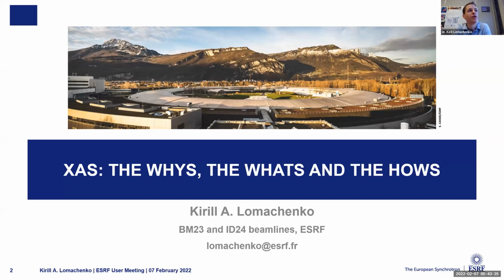What's lithium? Let me see. Yeah, it's like 30 electron volts or something like this. This is super low, so it's not reachable at all. But in general, your data quality, your life is much harder when you want to measure something light in the matrix of something heavy than vice versa.